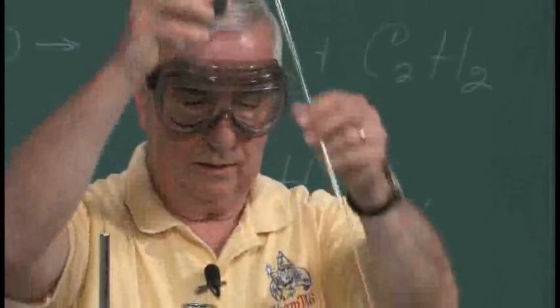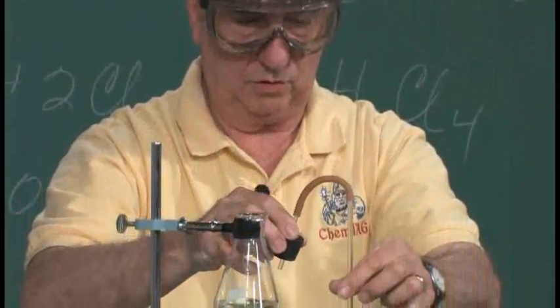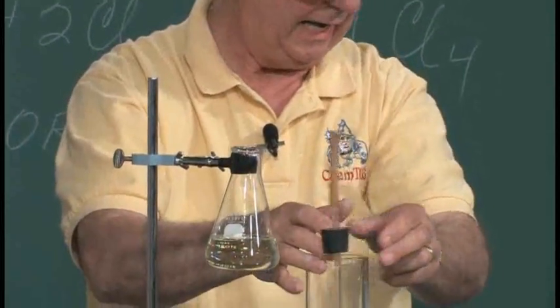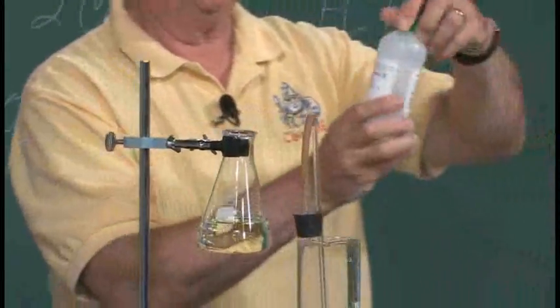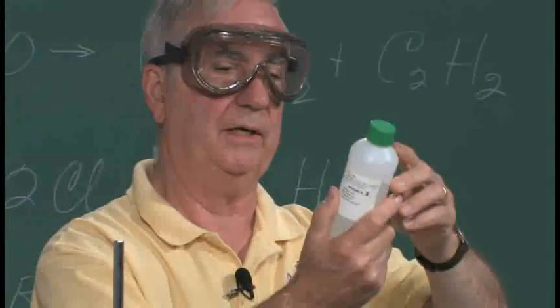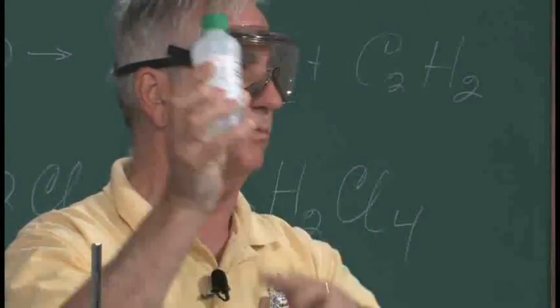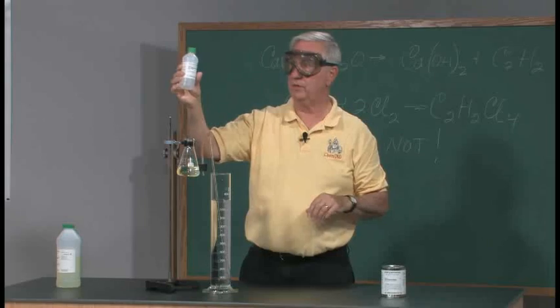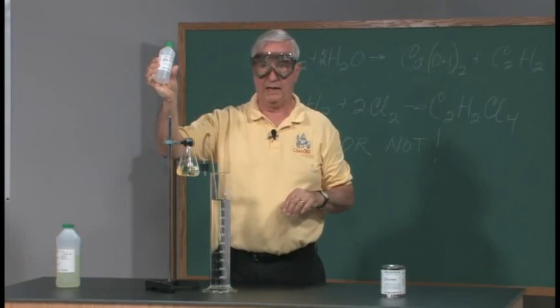The chlorine is generated by adding approximately 10 milliliters of concentrated, or in this case 6 molar, which is reasonably concentrated, hydrochloric acid.